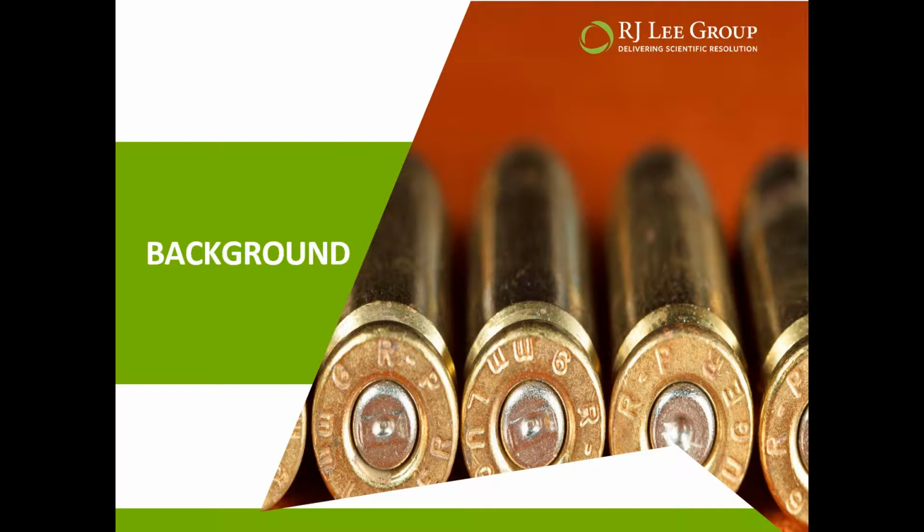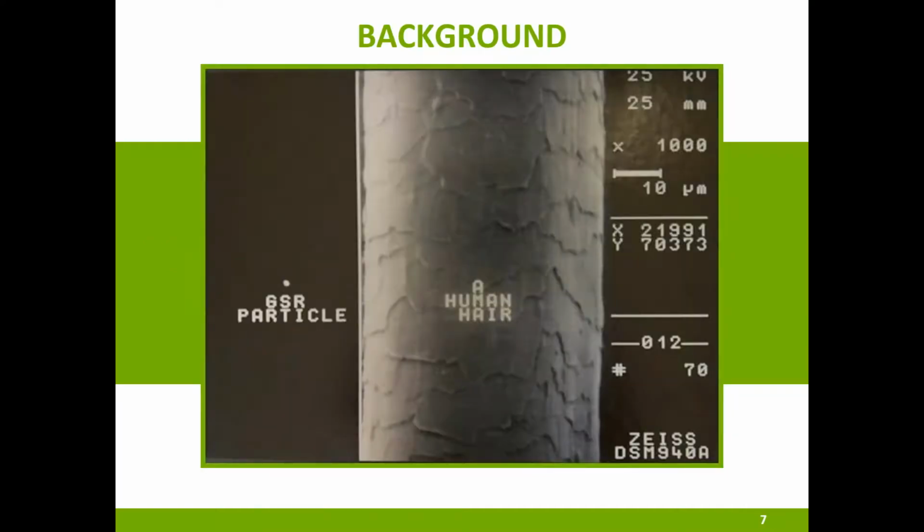And it's these specific particles that are characteristic of gunshot residue and that we call highly specific to the discharge of a firearm. These particles land on the hands and the clothing and the surrounding area of a shooter. These particles, however, are incredibly small. They can't be seen with the naked eye. They are microns wide. And to give you an idea of how small a micron is, here's a quick picture of the diameter of one piece of human hair next to a demonstration of a gunshot residue particle, that little guy there.